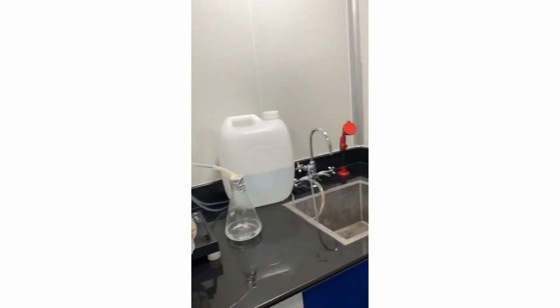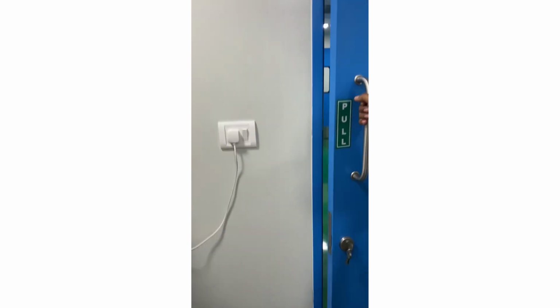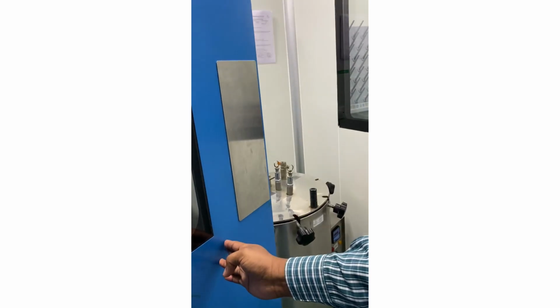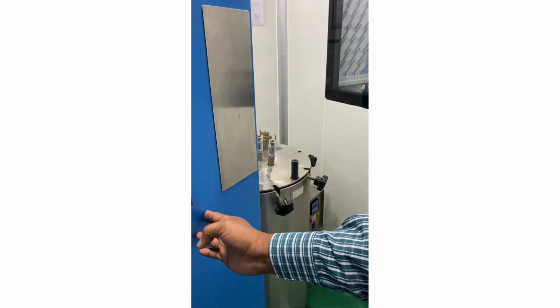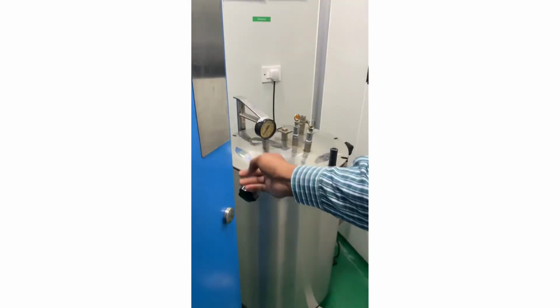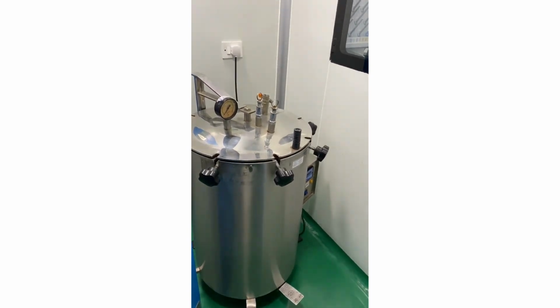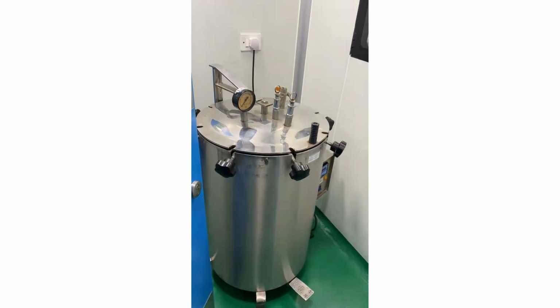After completion, we take the plates through this pass box to the decontamination room. The waste we get after the analysis, we decontaminate. Plates containing grown organisms can't be destroyed directly, so we do a sterilization process, 121 degrees centigrade for 15 minutes, here 30 minutes, to kill that organism.